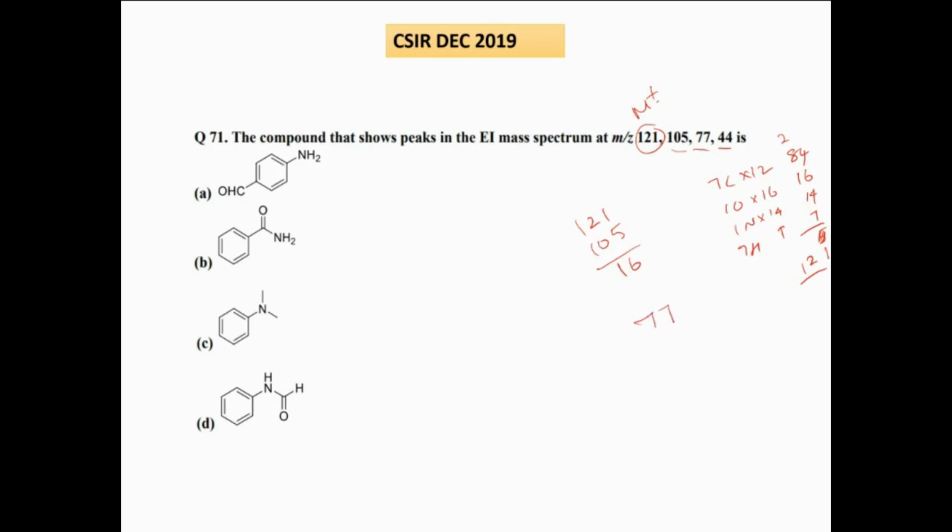Now this 77, I'll tell you, 77 is generally phenyl cation. இப்ப 16 இங்க வெளியே போகணும்னா மாலிகுலர் உடைச்சு பாருங்க. இத உடைச்சீங்கன்னா மைனஸ் 1 தான் போகும். இத உடைச்சீங்கன்னா you will be having CO, 28, 29 வெளியே போகுது. 29 மைனஸ் பண்ற மாதிரி எதுவுமே இல்ல. அப்ப இது ஆன்சரே இல்ல.